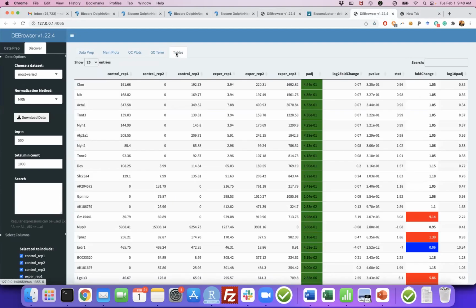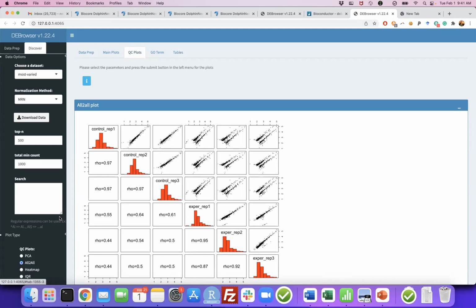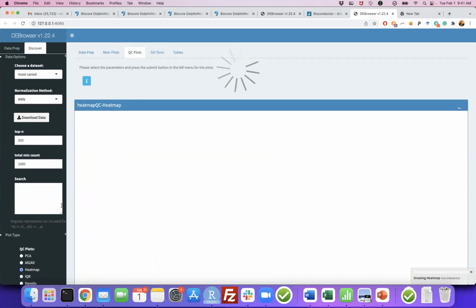I think most of the things that I showed you, you can play with. We have a tutorial there too in the bootcamp session. Go over it yourself and play with your data if you have it. Otherwise, play with this demo data. And again, you can learn a lot from your data without even writing code, just by playing with QC plots.